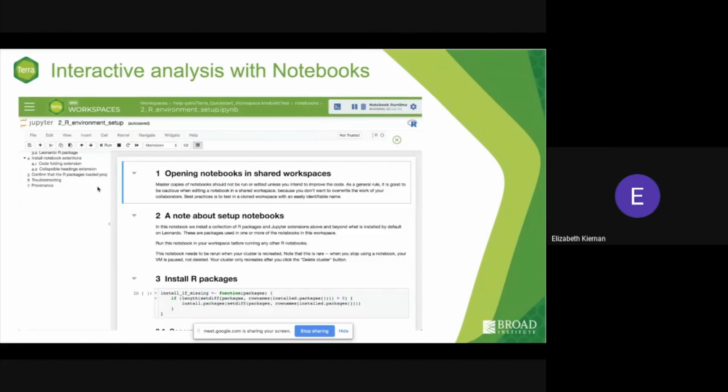You'll hear us talk a lot today about Jupyter Notebooks, and you're going to get to actually see a Jupyter Notebook in action in the live portion of this webinar. But for those who don't know, a notebook is essentially a digital version of a lab notebook. It's an area where you can describe different types of analyses using markdown fields like this one shown here at the top. And you can actually use code blocks to run code and interact with your data in real time.